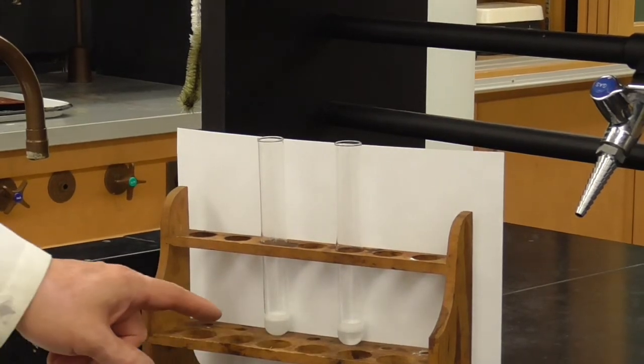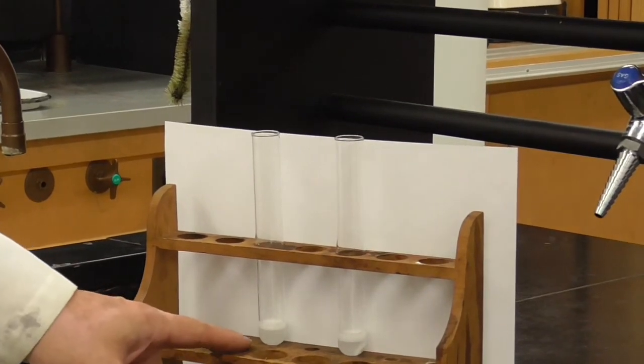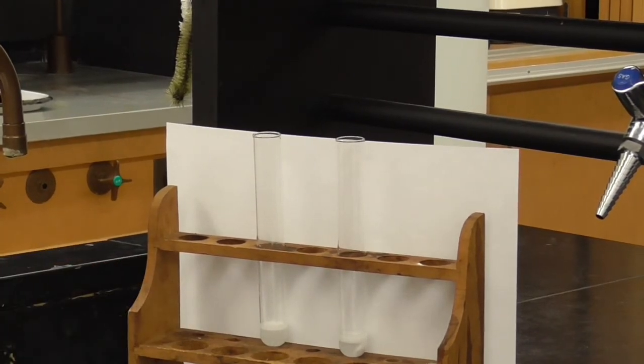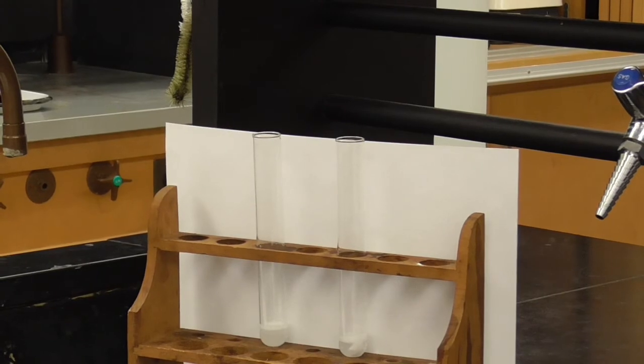And in fact, this one's slowing down quite a bit after that initial vigorous reaction, and I think it's slower at this point, where this one's actually faster now because it's, well, it's still going, where this one's wrapping up, it's almost done. So this one had an initial very fast kinetics, and this one was slower. We can watch it for a little bit.